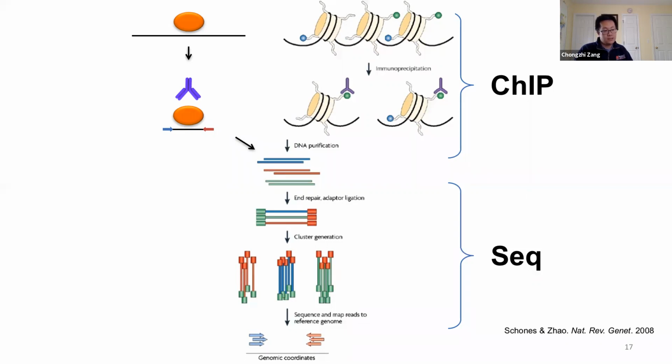In the single-end sequencing case, what we obtain is the end sequence, randomly from either end of the DNA fragments. But nowadays, more and more people are starting to use paired-end sequencing, because in paired-end sequencing we can guarantee to get the information from both ends of the DNA fragments. But the cost will, of course, be double, because we have two sequencing reads for one DNA sequence.